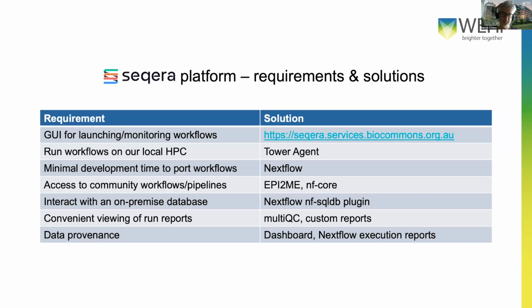We went through a number of different requirements, and we needed to make sure that Seqera Platform could meet these requirements. So first we needed a GUI for launching and monitoring workflows. This is because the lab techs needed to have a very easy to use system. They're not bioinformaticians, they're not too familiar with the command line, so it needed to be really easy. And so this was provided to us via a web interface by Bioinformaticians to the Seqera Platform.